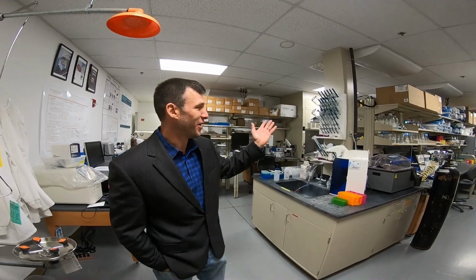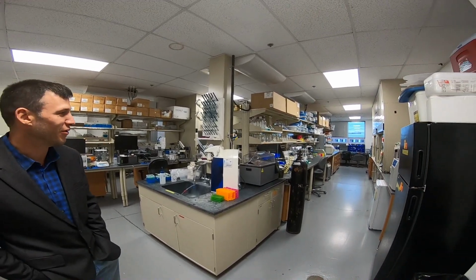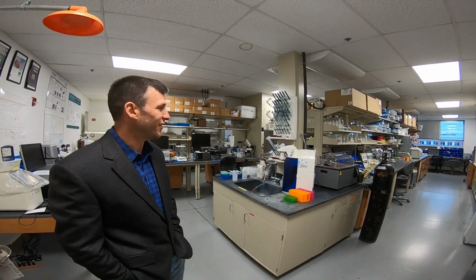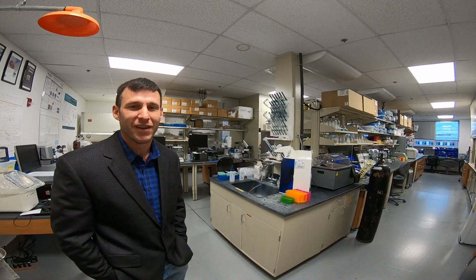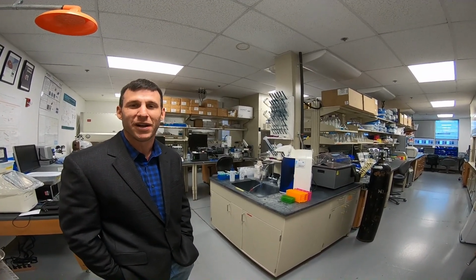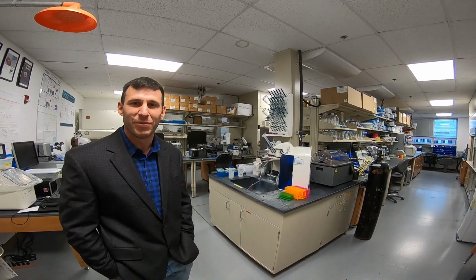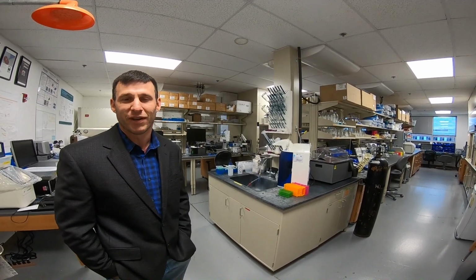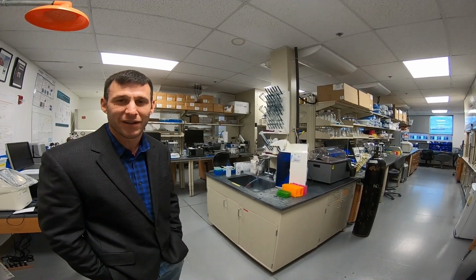So this is the Biomanufacturing and Biosensing Lab. It's about a 1,300 square foot laboratory, and this is a dedicated space where we focus on trying to make process innovations related to biomanufacturing, and specifically we're focused on making innovations in the process monitoring and sensing areas. So a big focus of what we do in the lab is trying to apply automation for improving biomanufacturing processes and improving characterization of biomanufactured products.